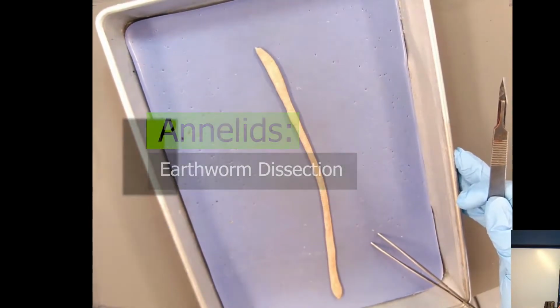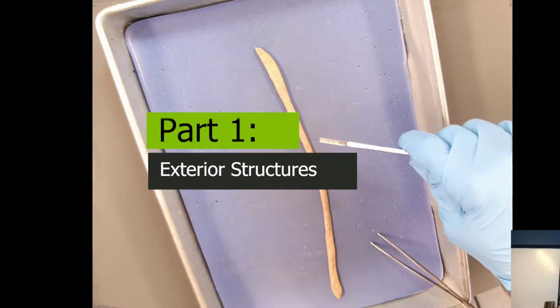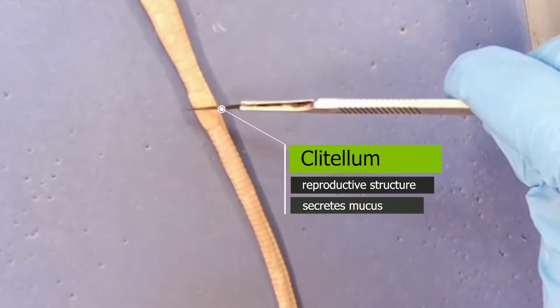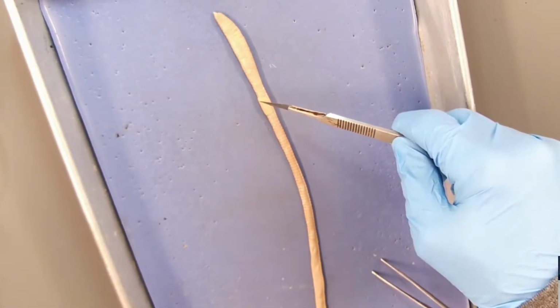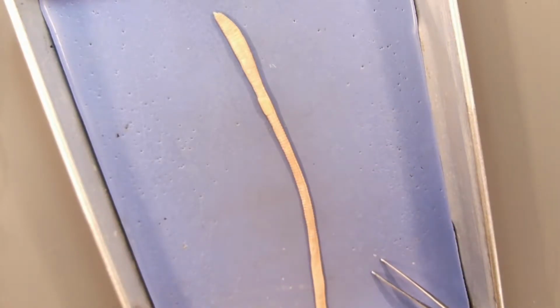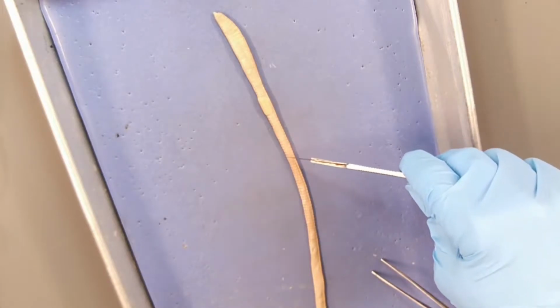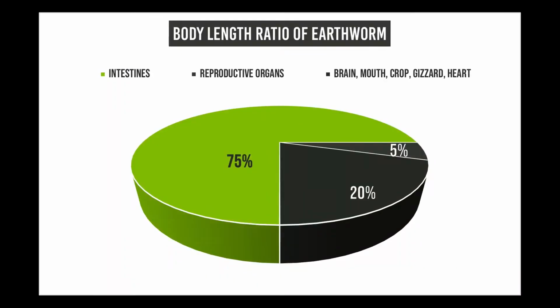This, of course, is an earthworm, and typically when you dissect it, most of the body, maybe 75% of the body below what's called the clitellum, which kind of looks like a Band-Aid. If you had two earthworms that wanted to reproduce, this clitellum releases mucus, they stick together and exchange sperm, and so they basically cross-fertilize each other. But below that clitellum, most of what you see here, about as much as 75% of the length of the body, is actually intestines.